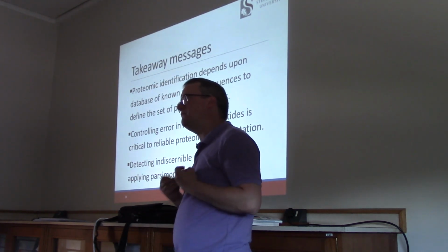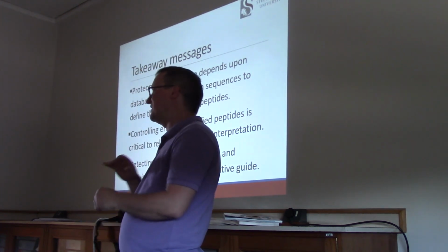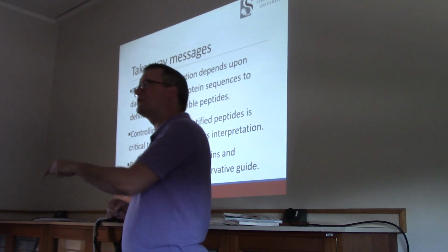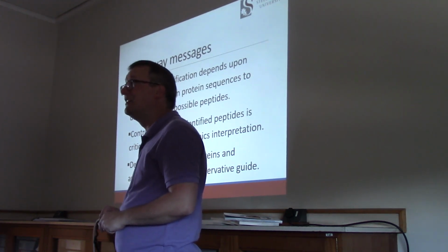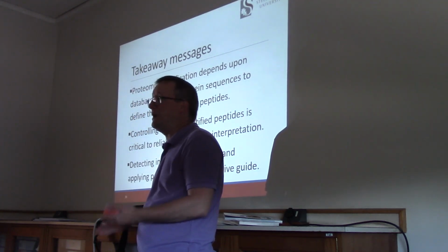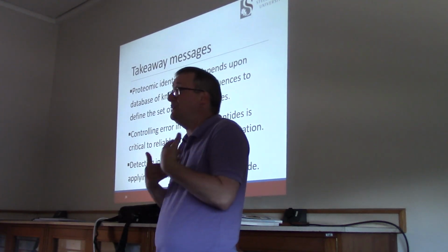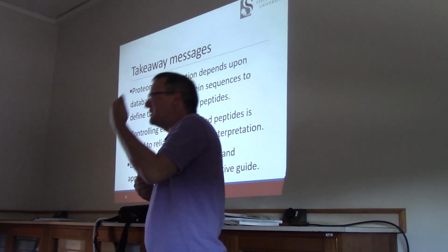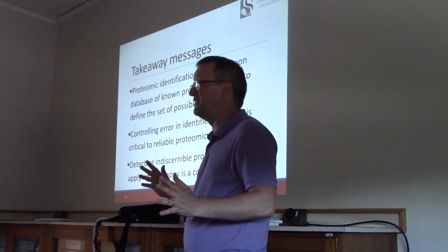So lots of people fall in love, right? They have some result in their search results. They've got hundreds of proteins and they really love the story, their biological story they're going to tell about this one protein. And they feel sad when curation eliminates the evidence for their pet protein. We as scientists have got to be careful about falling in love with the story we're going to tell rather than what the data have to tell us. It's part of the job, unfortunately.